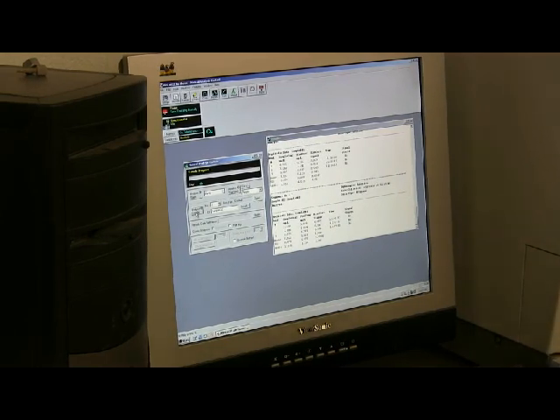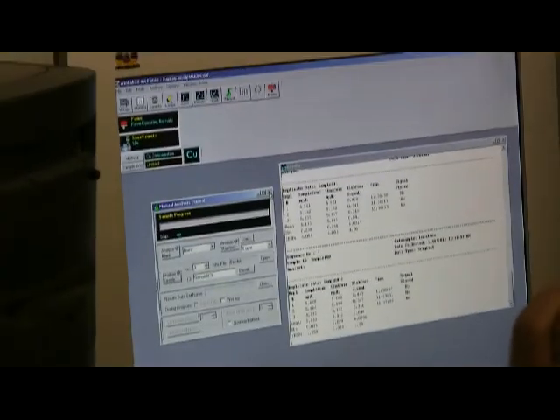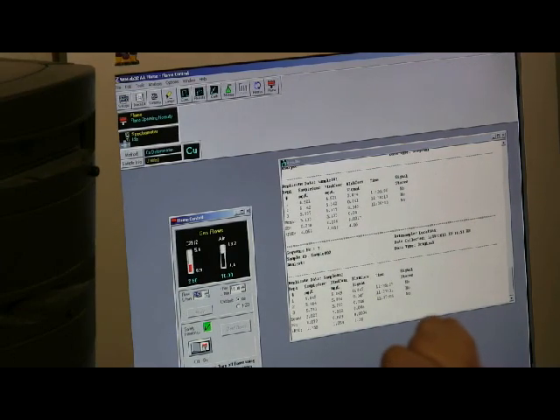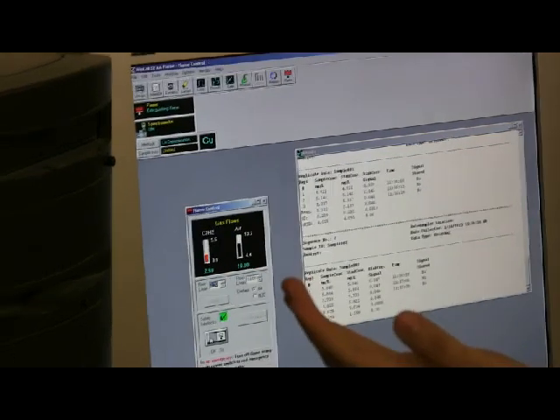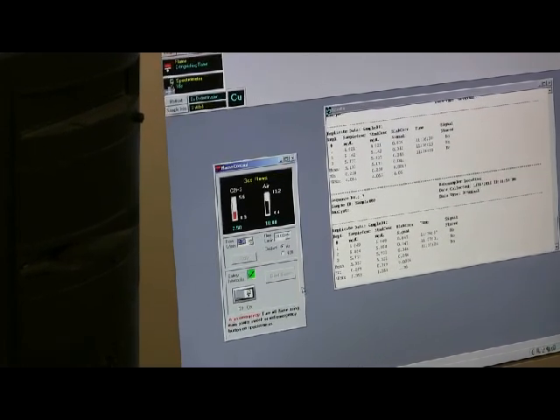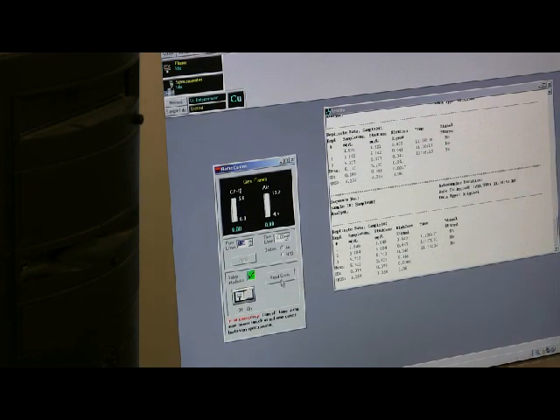Now I'll show you how to generate a report. So now when you're done, you just need to close this, click on save, and switch it off. And then click on bleed gases.